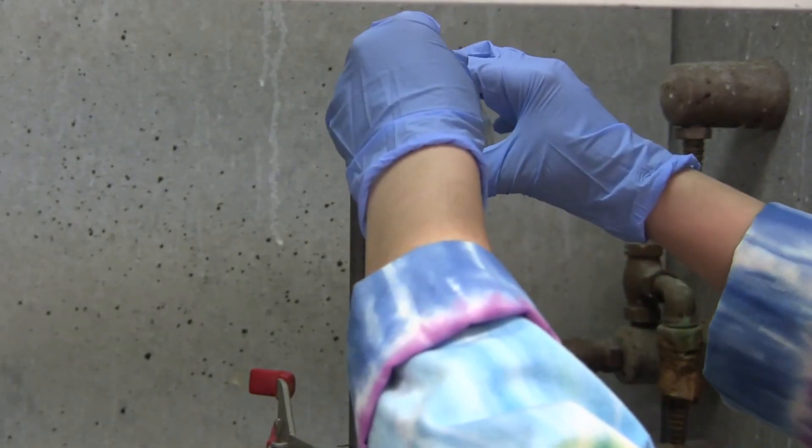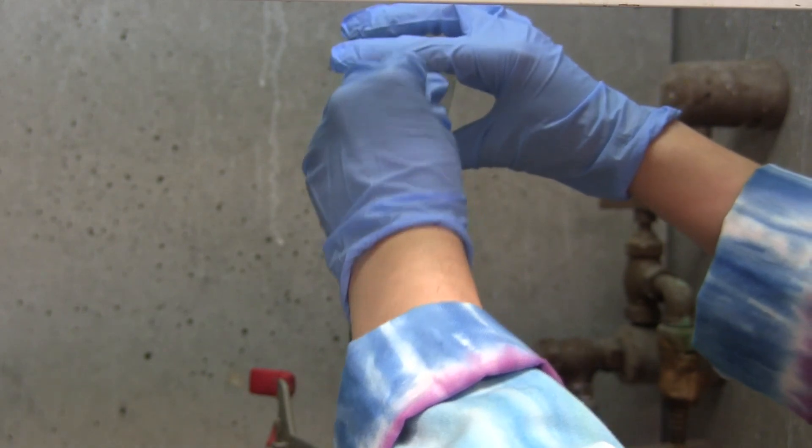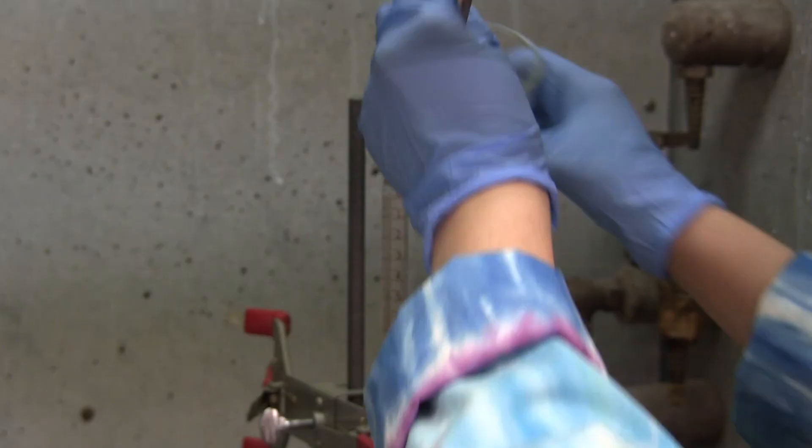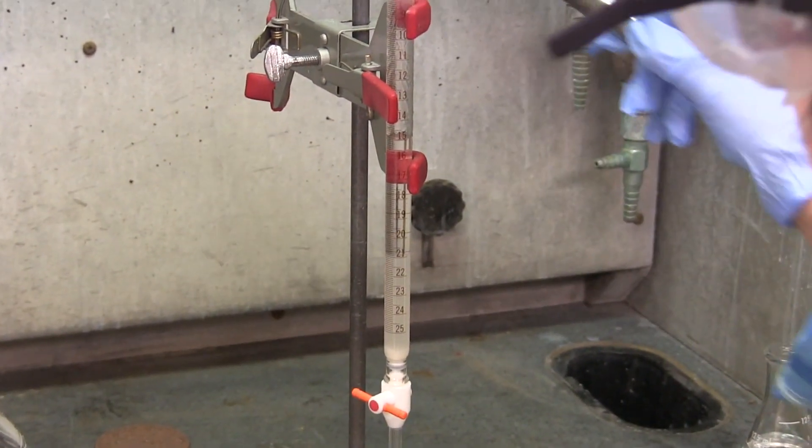The slurry is poured into the burette. A stirring rod can be used to help transfer the slurry. Adding more hexanes can help move the slurry down the column. While pouring, tapping the edge of the column with a pencil helps to dispel any air bubbles as they would affect the separation of the compounds.